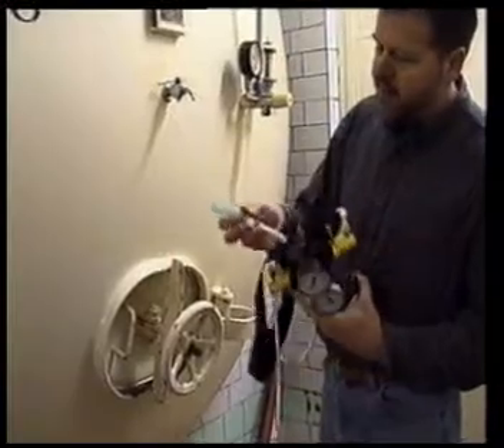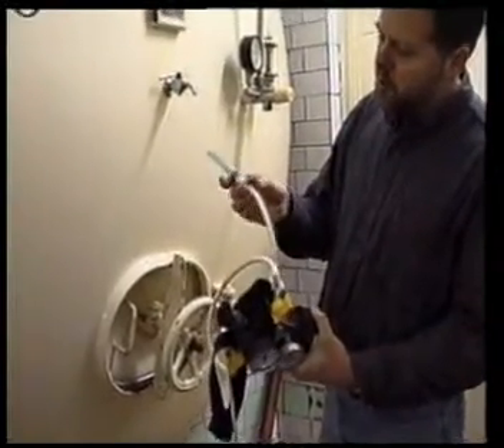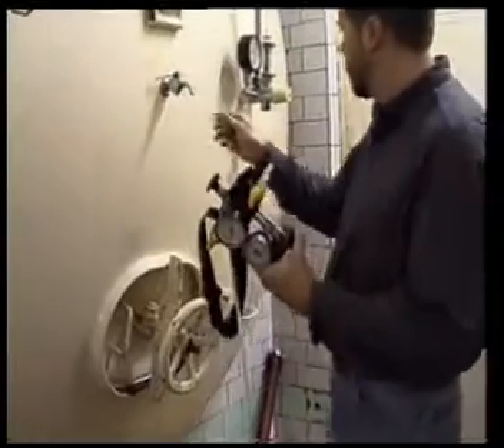Here we have clamped our narrower hose onto an adapter and then onto a wire hose.